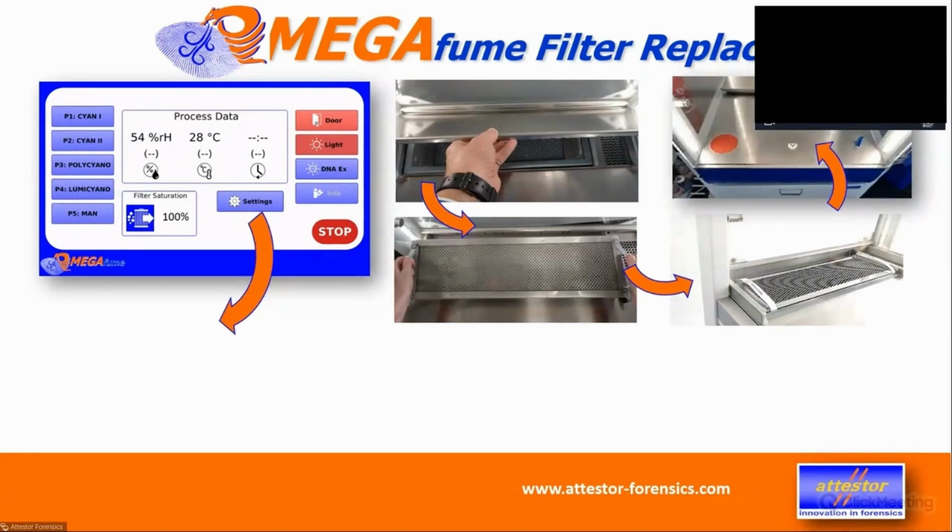There is a kind of safety feature in there. We're actually measuring the pressure above and below the cassette, and by this we can kind of guess the saturation. So if your students are going to reset and reset and reset and not replace the filter, after a certain time the system will say, do you want to trick me? That's not possible. I should have actually more air throughput on the new filter.